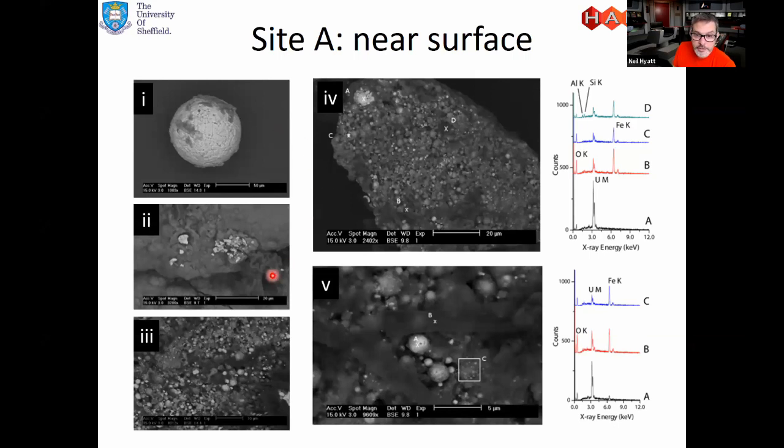So many depleted uranium particles are found to be clustered together, suggesting adhesion to and agglomeration with the soil particles and other impact material. The morphology of the particles in these soil samples is consistent with other studies of DU impact material, including controlled firing tests and particles recovered from conflict zones in the Balkans and the Gulf Wars, although the environmental conditions here are clearly very different from those locations. So that's what the DU particulates look like.